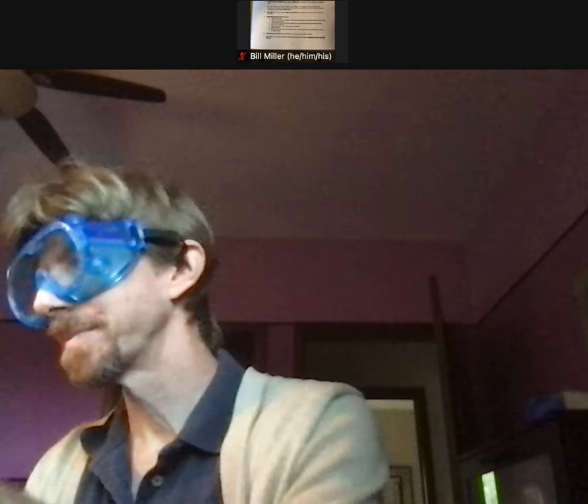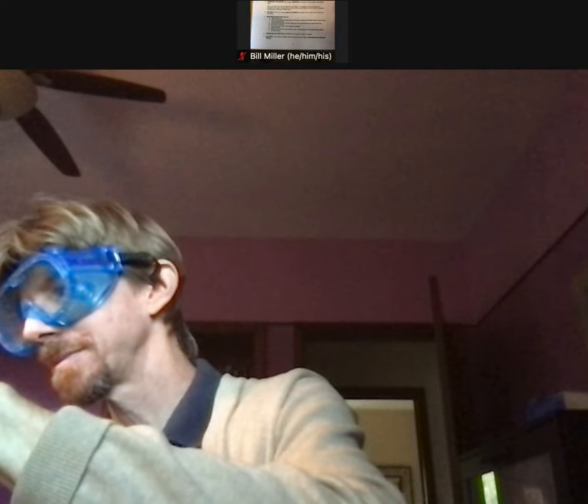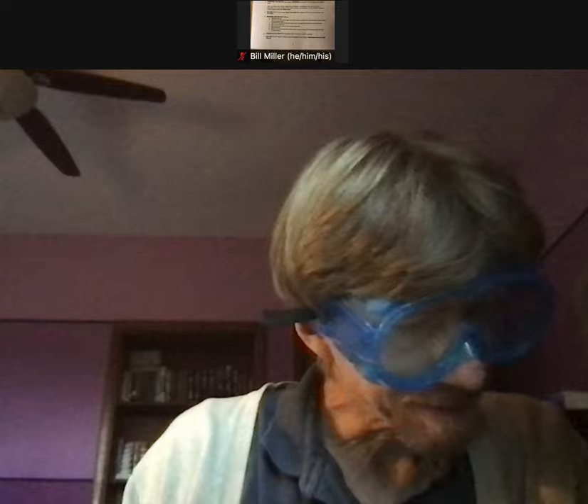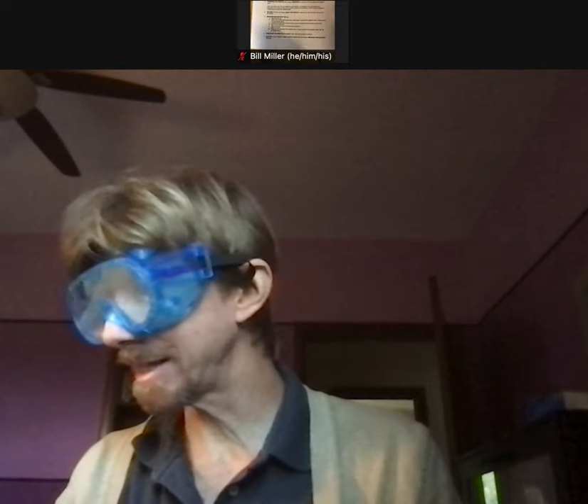Pour 40 milliliters of the solution into a 50 milliliter beaker. I almost did the wrong beaker. That's about 40 milliliters, and I've put B on this one for base. It was clean and dry. Conditioned the pipette with vinegar. So I've got my vinegar in my A beaker.